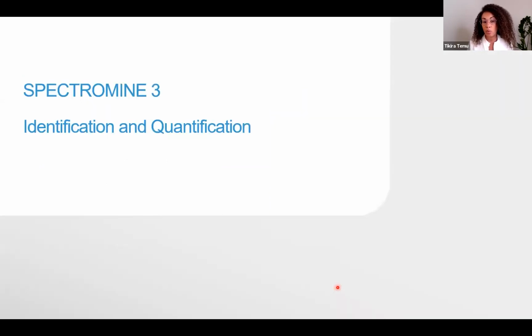Next up, it's also quite important that we see how SpectroMine performs in terms of identification and also quantification accuracy. Therefore, I first have another polling question for you. Which software are you using to analyze your DDA data? And sometimes it's not just one, so it can also be a multi-selection here: SpectroMine, MaxQuant, Proteome Discoverer, Peaks, or another software.